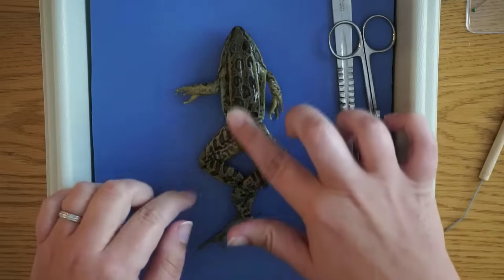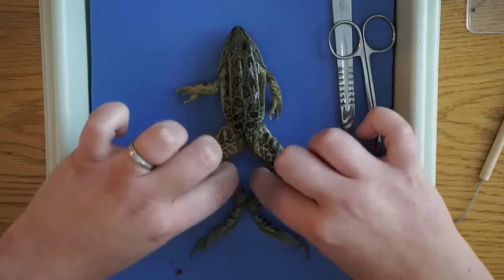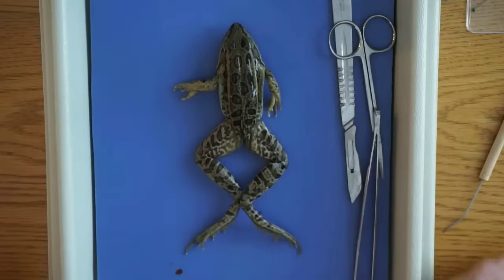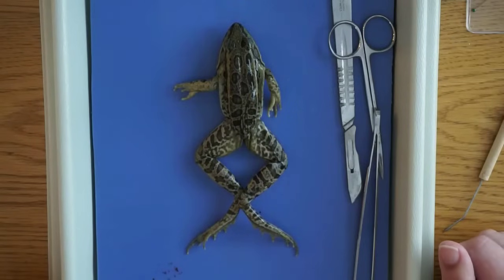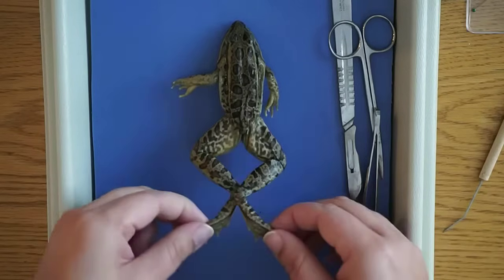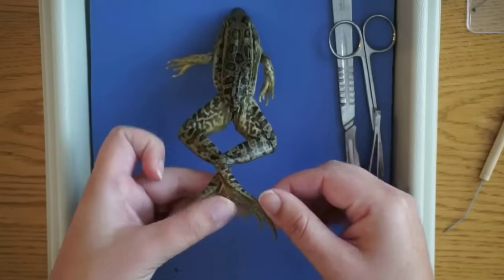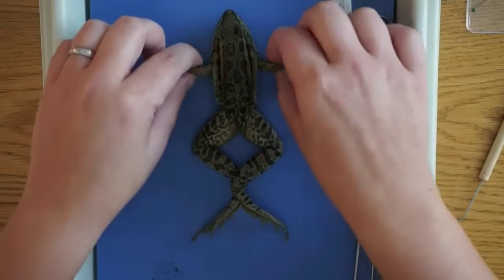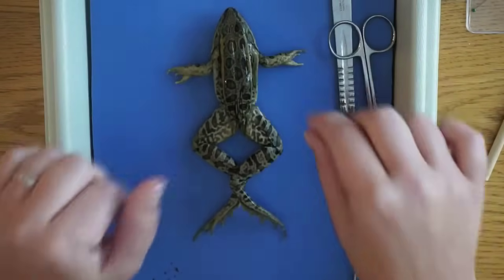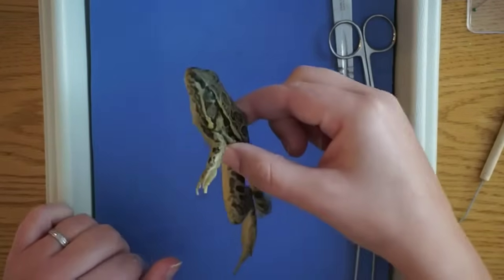Let's start on the dorsal side — you can feel that the frog has nice smooth skin. Remember, amphibians can breathe through their skin as well as through lungs. The frog has webbed feet for swimming, and you can see the difference between the forearms, which are much shorter, and the hind legs, which are used for jumping and swimming.